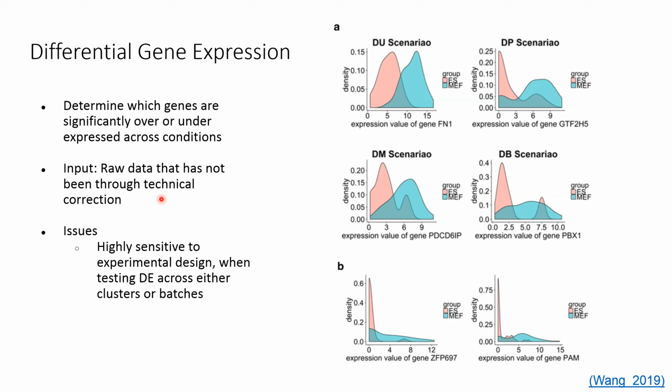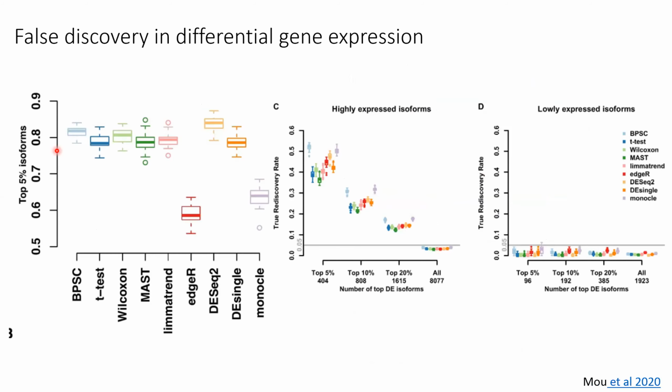There also, however, exists some concern in the field that because the nature of single-cell RNA-Seq data is that there are very many zeros in the data, and there are potentially distributions that are bimodal in different ways, this comparison of means might not be the most appropriate method to identify differentially expressed genes. So if you look at the literature, there exist several model-based approaches that try to overcome these issues of multimodality and sparseness to improve on the identification of differentially expressed genes.